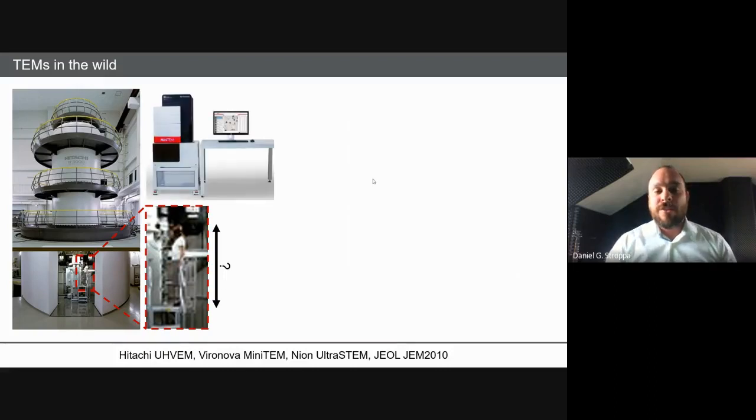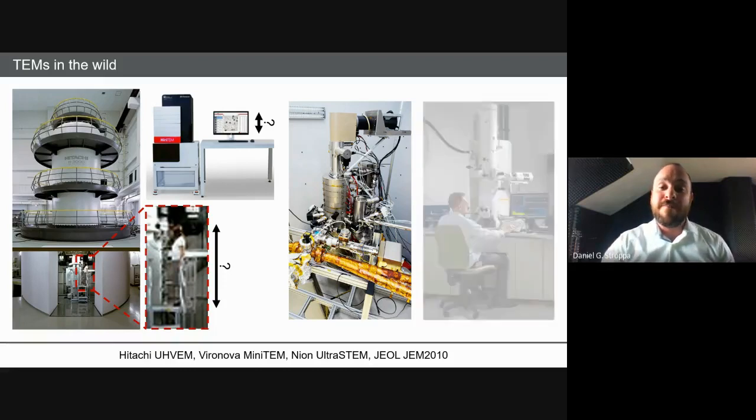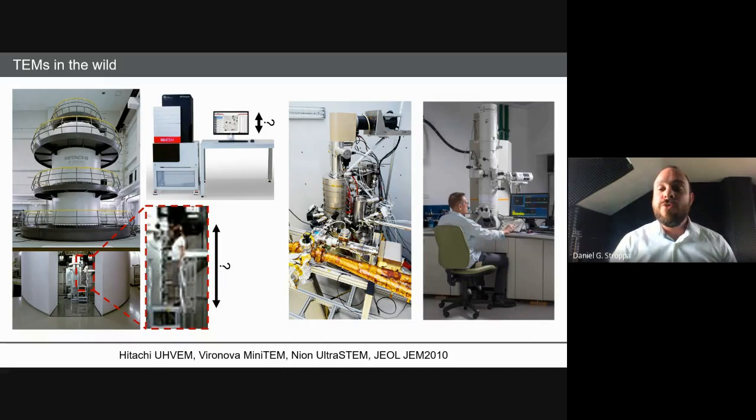You also have miniature TEMs. It's pretty recent, but you can scale to the monitor here. There are some TEM microscopes that look much closer to a synchrotron facility or a beam line, more open experiments and more flexible in terms of what you can do, and sometimes more complicated. And the most usual, when you think of a TEM, I think this is the most common image. It's a microscope that you sit next to. You have the binoculars to observe a fluorescent screen, and this is the most famous environment, even though nowadays most TEMs are operated remotely.